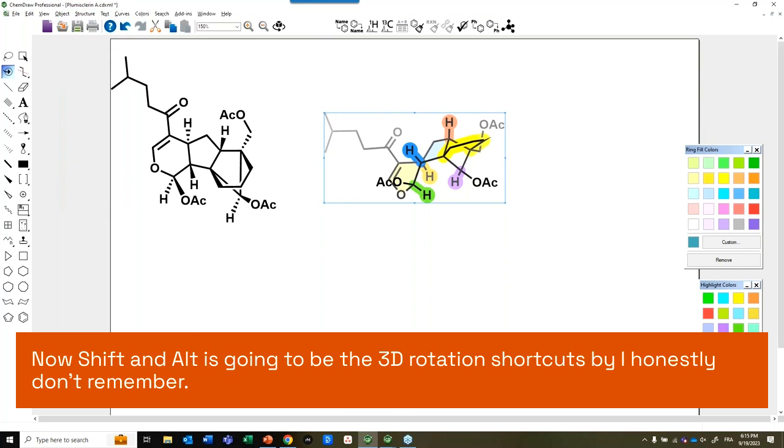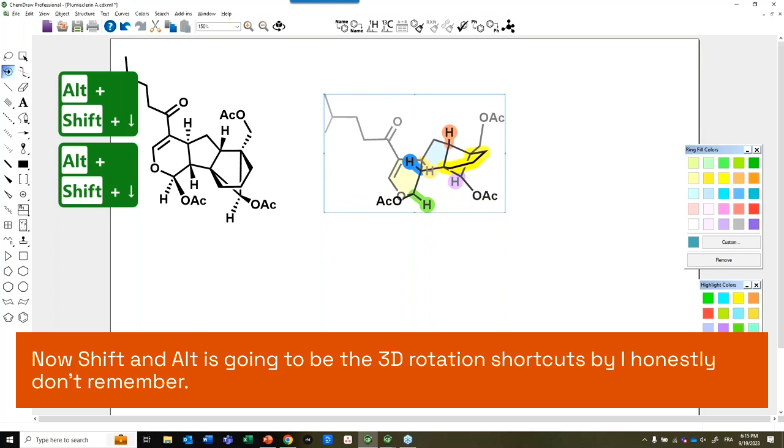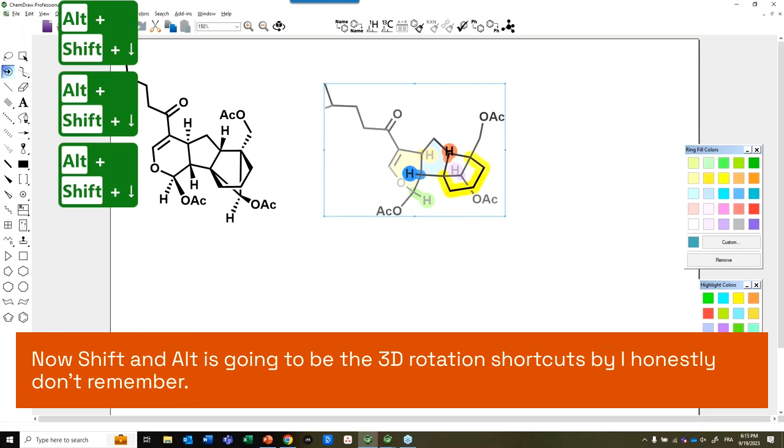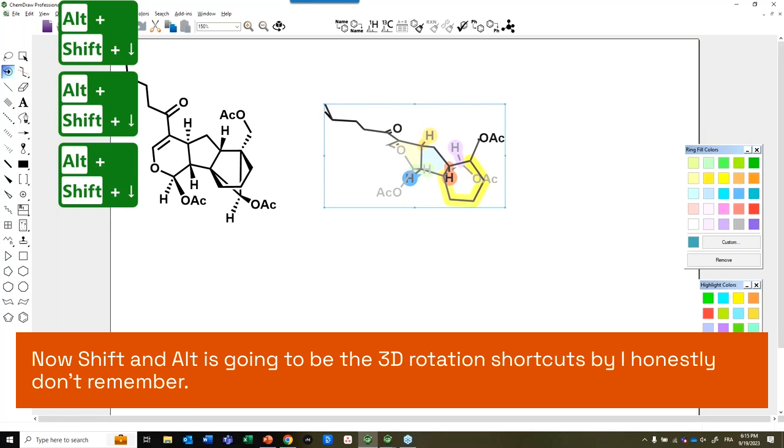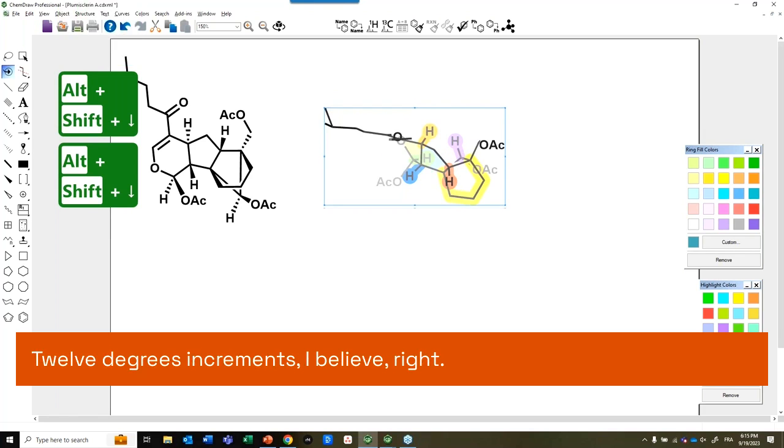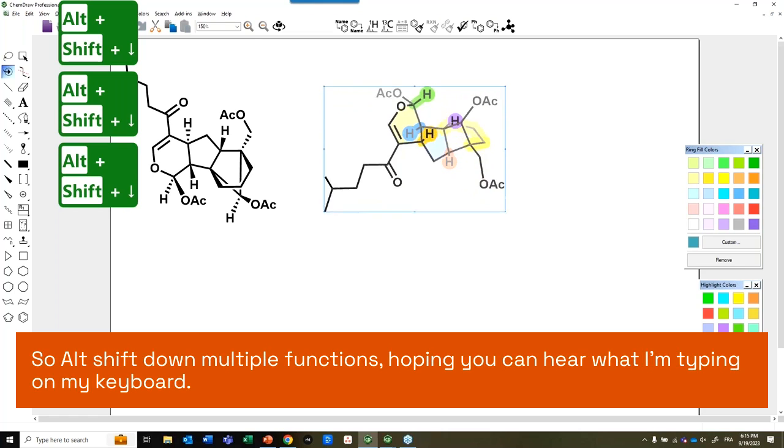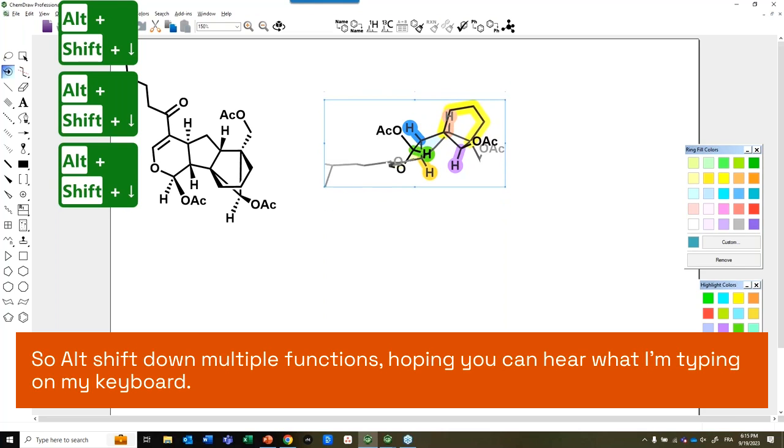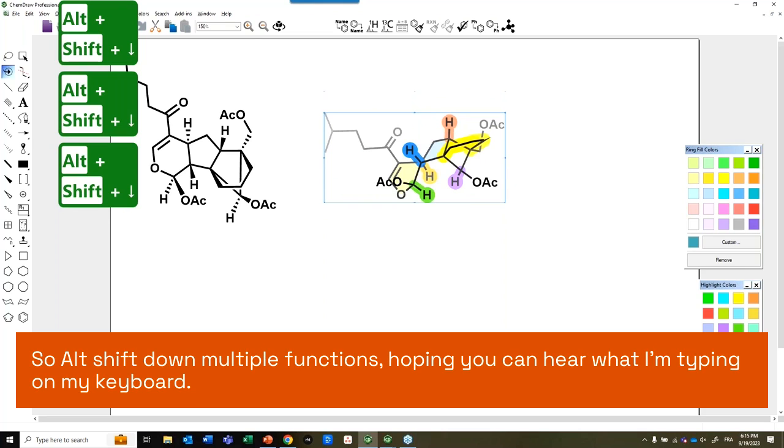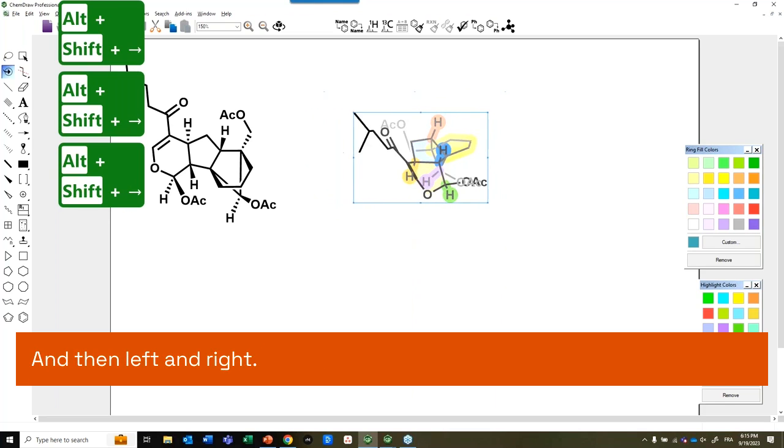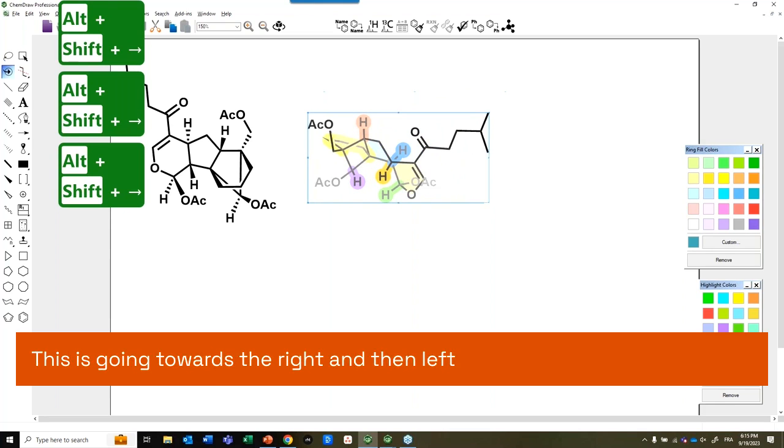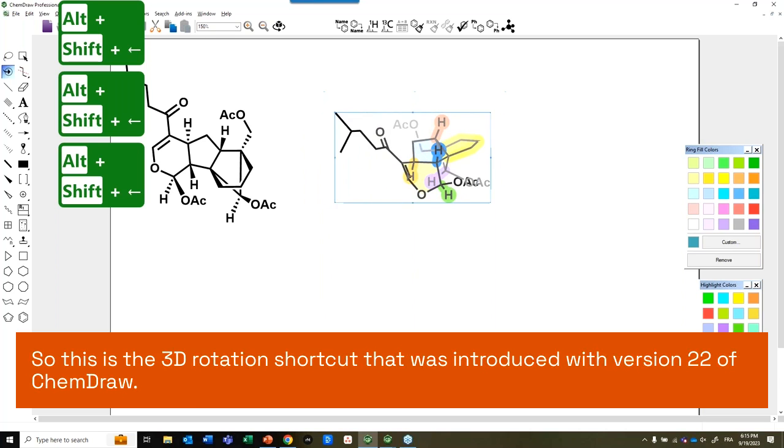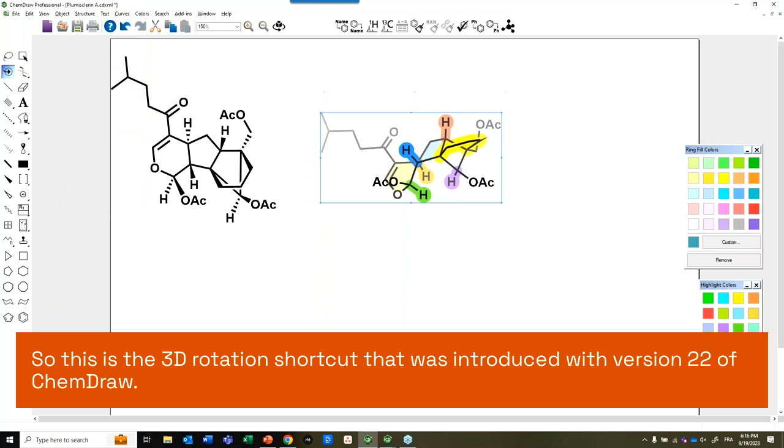Now, Shift and Alt is going to be the 3D rotation shortcuts by, I honestly don't remember, 12 degree increments, I believe. So if I go Alt Shift Down multiple times, I'm hoping you can hear what I'm typing on my keyboard. And then Left and Right, this is going towards the right, and then Left, obviously, we go the other way. So this is the 3D rotation shortcut that was introduced with version 22 of ChemDraw.